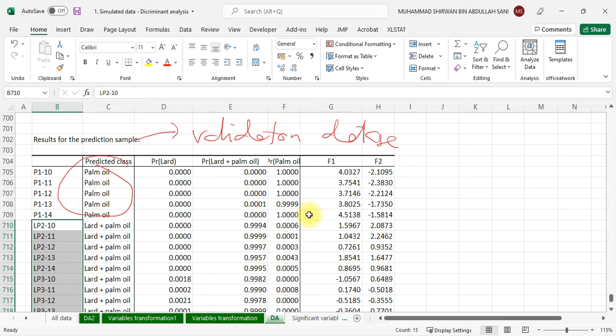In cosmetics as well, we have 40 to hundreds of ingredients in one sample of your moisturizer cream. In that moisturizer, they also have inhibitors, where if we want to conduct a DNA test, the inhibitors will inhibit the amplification of our DNA. So that's why people go for fatty acids using GC. But this is another challenge in actual samples.